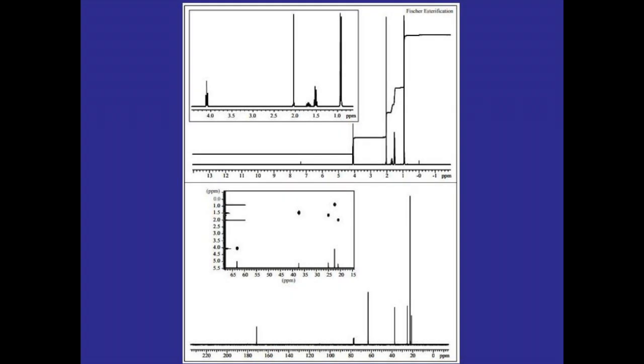In this video I'm going to show how to label your NMR spectra, and to do so I'm going to be using one of the NMRs from the Fisher Esterification Lab as indicated in the top right hand corner.